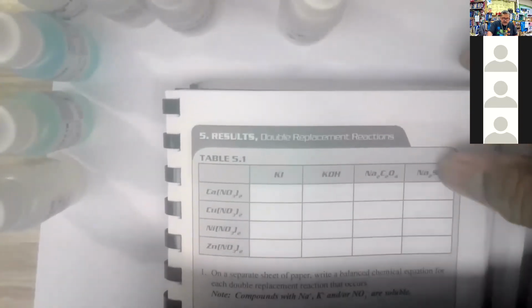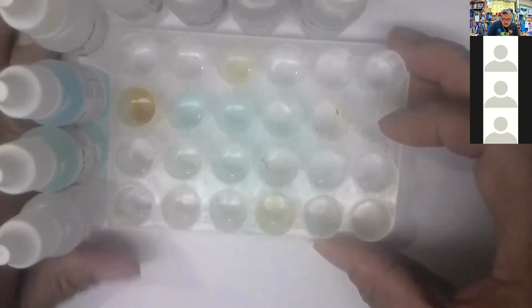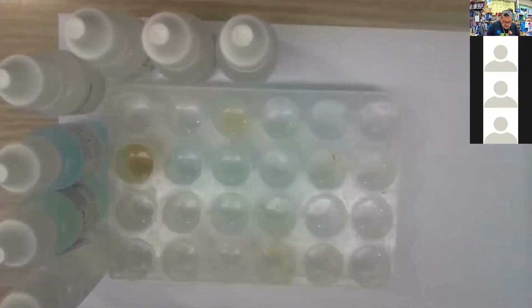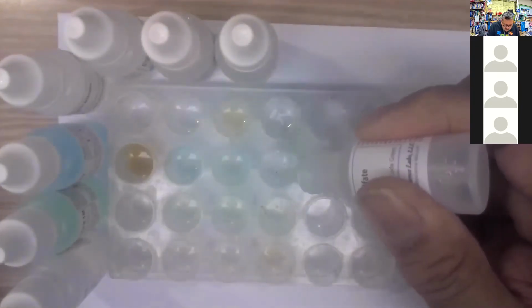And then the fourth column right here, sodium sulfate. We're going to go down, add 3 drops. There's the sodium sulfate. And we'll put the well plate back. And there we go, set that up so the bottle's in the right place. And so now we're going to go down here and 3 drops of each. Let's look for a color change in this row. Here we go. 1, 2, 3. Not really.